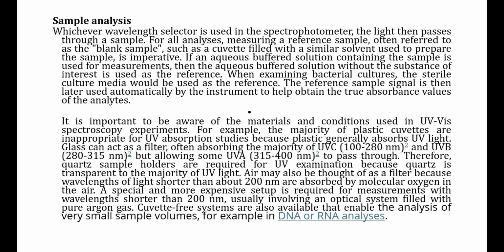So the presence of the desired molecule in a given sample, its quantity or concentration, its degree of purity, all these things can be analyzed. So lambda max is the concept where a particular analyte gives maximum absorbance, and that wavelength you are going to choose. So the wavelength where the analyte gives maximum absorbance is lambda max. All right. Now when you talk about keeping a sample, you need a sample holder, that is a cuvette.